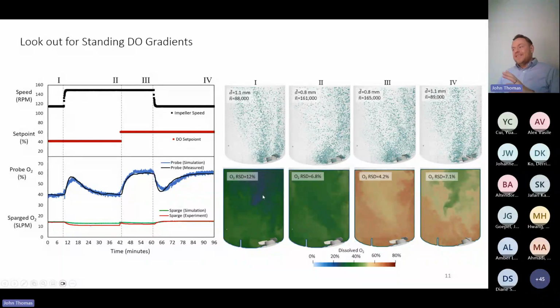So it's neat to see that the physics predicted from the code, which was initially anticipated at this magnitude, was corroborated. As we got this overall global response, we were then able to peer inside the tank and see the net effect of this dynamic system on potential gradients across the vessel and how that might inform cell growth. That was a big deal.